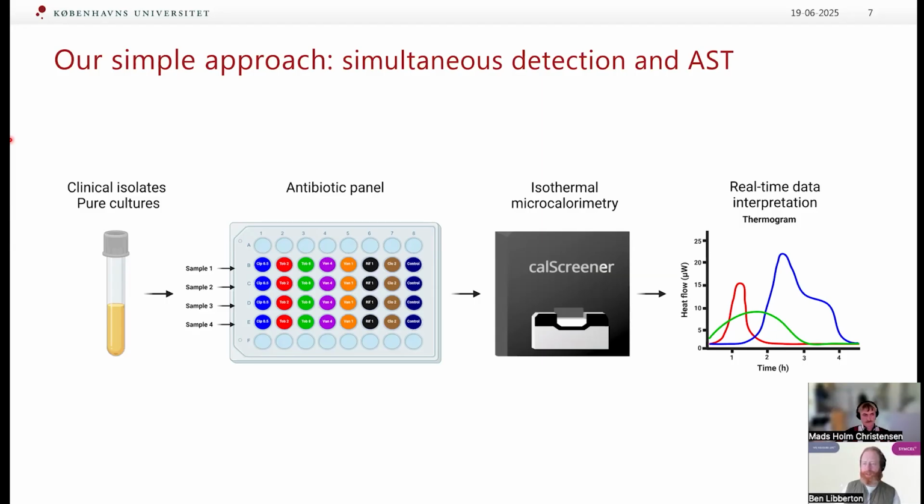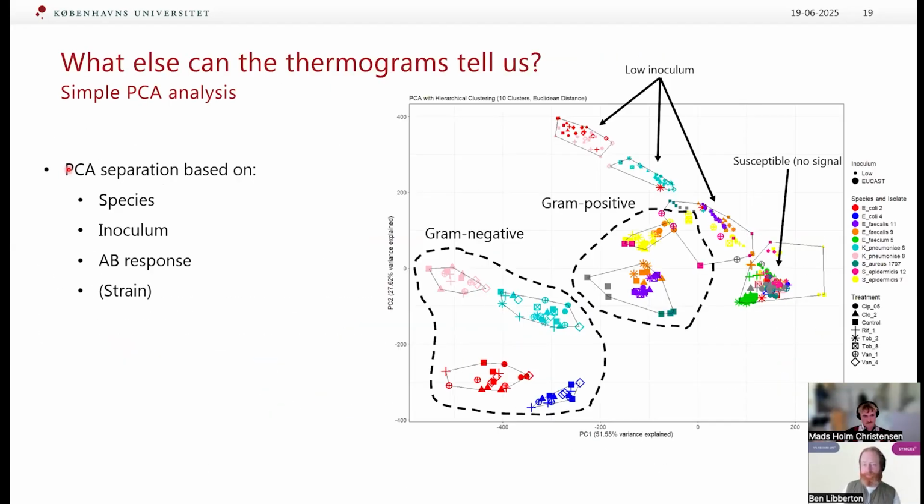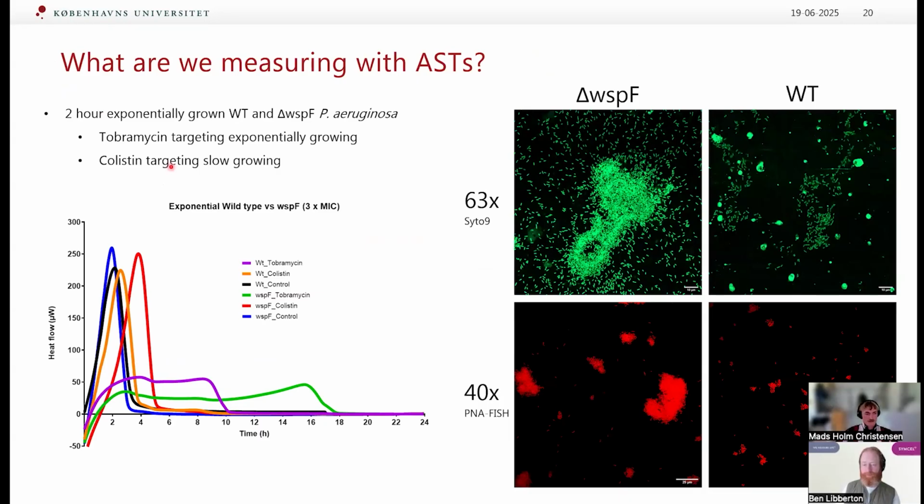Another question here. Do you see enhanced metabolic output by the WSPF on a longer timeline than the wild type? So, does overproduction of the EPS, is that a cost? I do see, as you can see in this graph, there is no more to see after 24 hours.